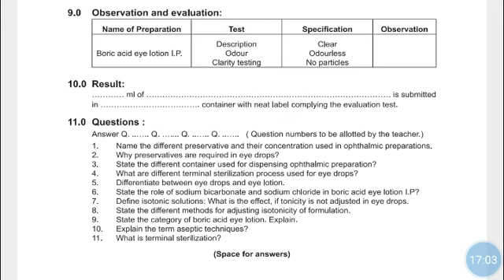Observation and evaluation: check whether the solution is clear, odorless, and particle-free, and write down all observations. Result: 10 ml of Boric Acid Eye Lotion is submitted in a glass vial container with a neat label complying with the evaluation test.